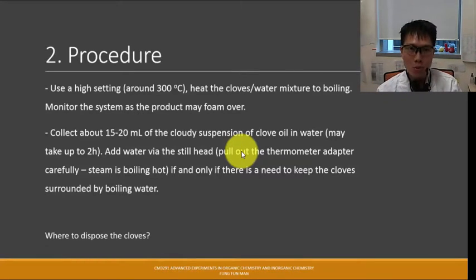It might take up to 2 hours, but it could be as short as half an hour, or if you're lucky, or you may call it unlucky, a split second, maybe 15 minutes. You just have to observe. You can't depend on what we tell you, because the conditions will change. The temperature changes, the atmosphere varies a bit, and our skills are different, okay?